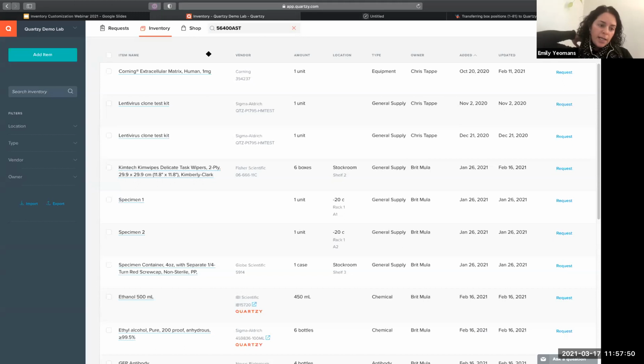Yeah, and I just want to reiterate, you can create those custom fields. I know we've got a couple more questions, and I know people were trickling in, so you may have missed this part, but you can definitely add custom fields after the standard fields and add whatever, serial numbers or whatever sublocations, any other information that you're looking for. You can definitely do that.